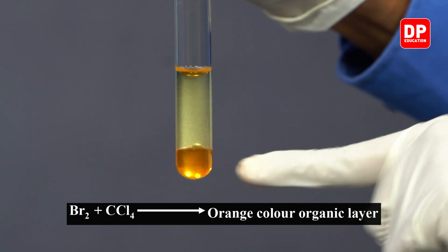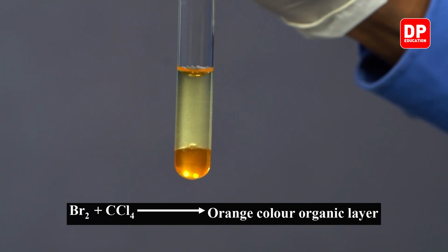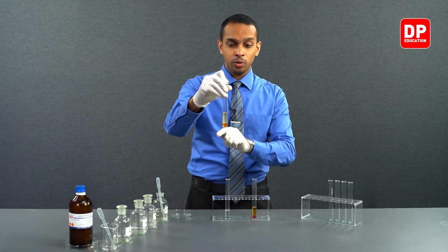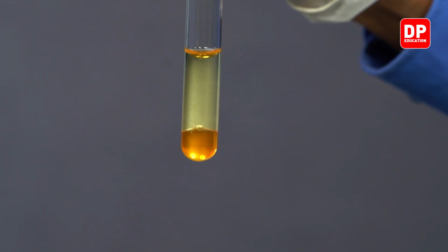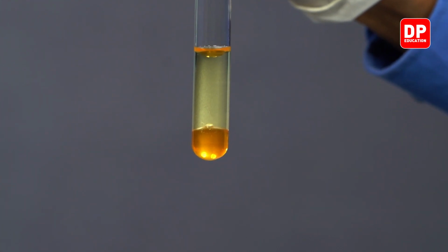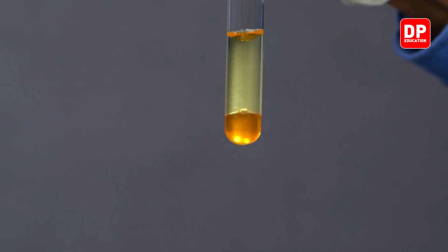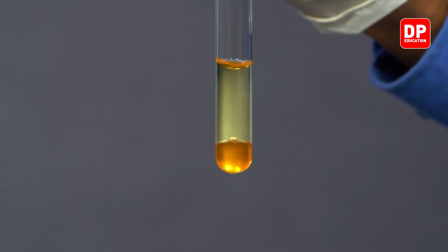Bottom layer is our carbon tetrachloride. Carbon tetrachloride is nonpolar, as I mentioned before, and the bromine, or Br2, that is formed is also nonpolar. So bromine dissolves in the nonpolar layer better than it dissolves in water. Water is a polar solvent. So bromine dissolves better in the nonpolar layer and turns that carbon tetrachloride nonpolar organic layer into an orange color.